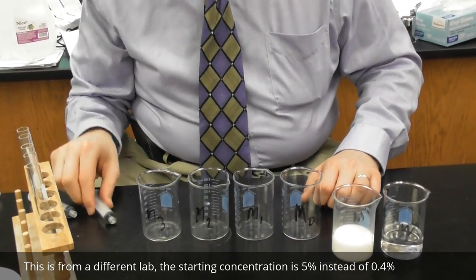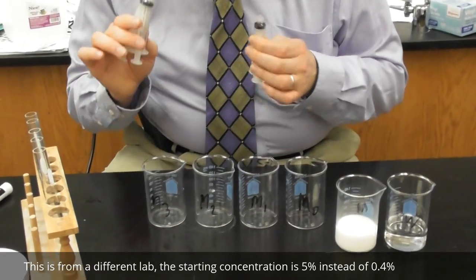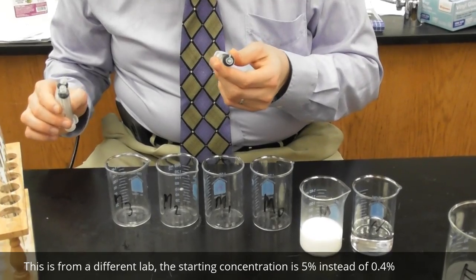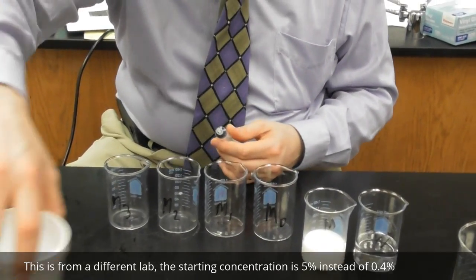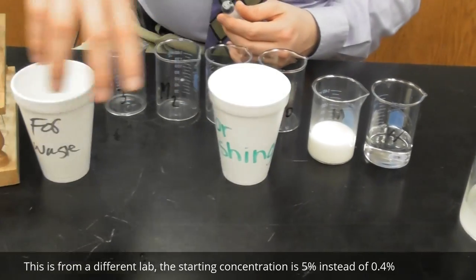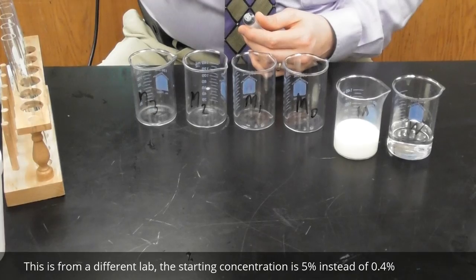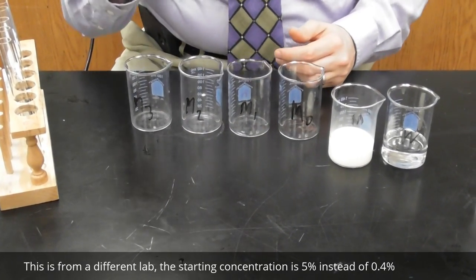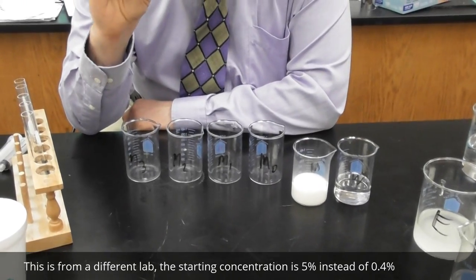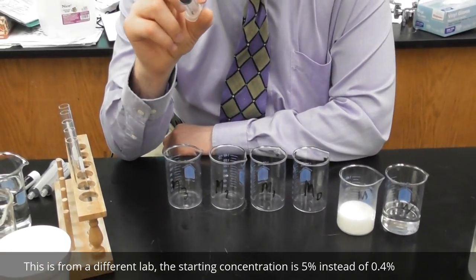All right, so I've been given for this lab 3 syringes, but I'm gonna show you how to reuse syringes as well, all right? Using one for washing and one for waste container. For washing and for waste, all right? So I'll put those off to the side for now. All right, now, this is a 10cc syringe. Now, my instructions call for 20 cubic centimeters.